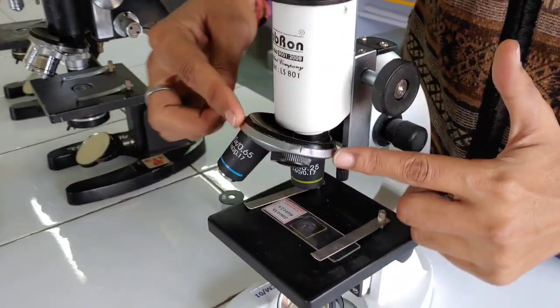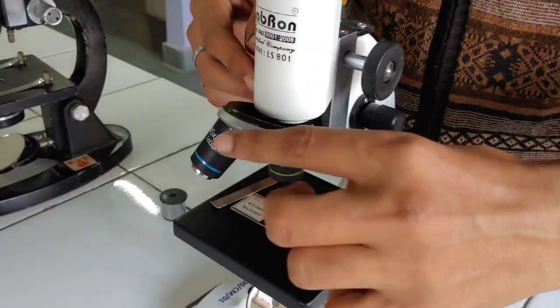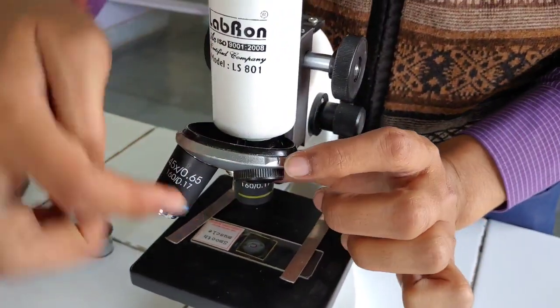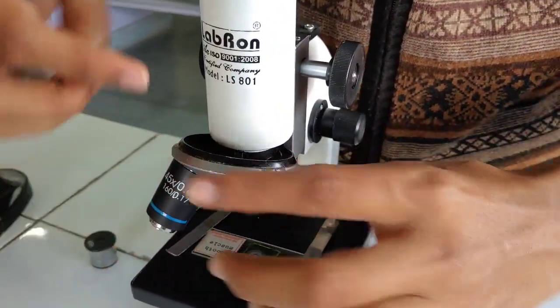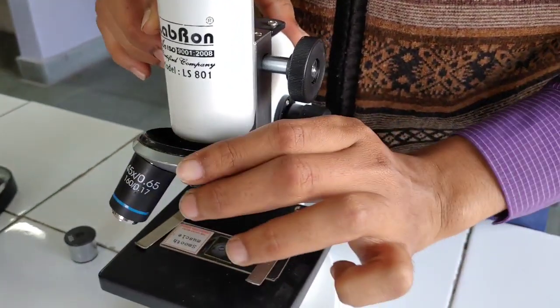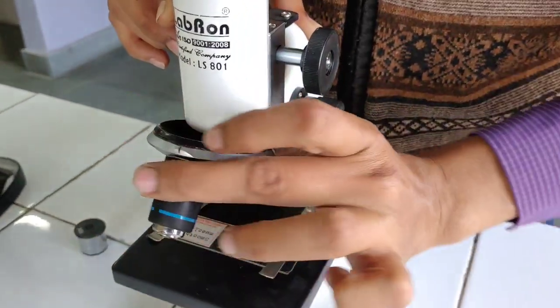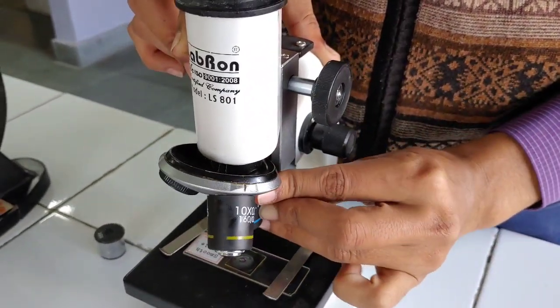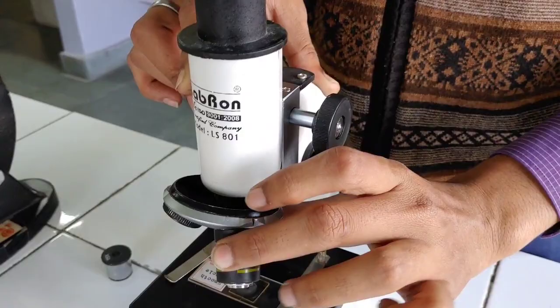Next is nose piece. It is the part of the microscope that holds the objective lens. So it is also called as revolving nose piece. As you have seen in the video, it can revolve and you can adjust the objective as per your wish.